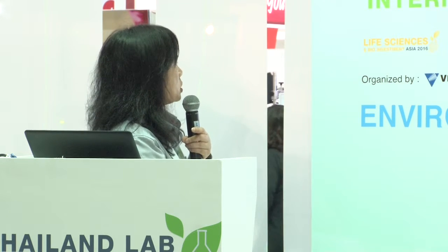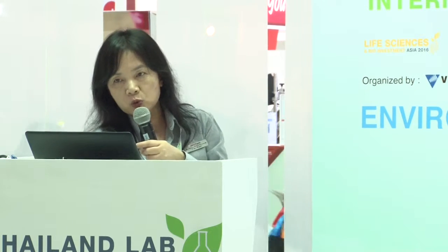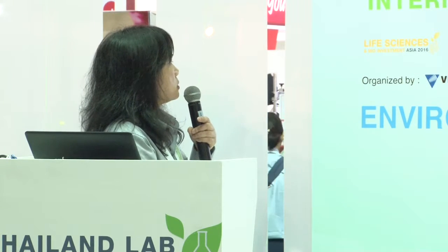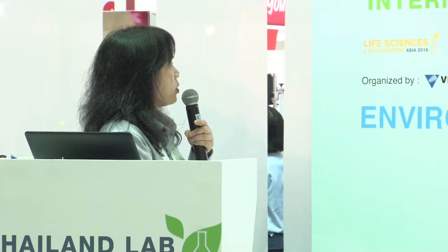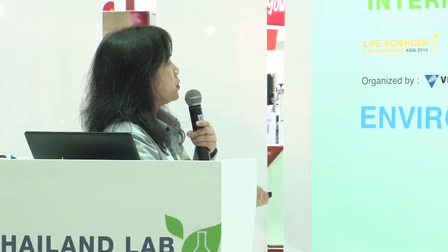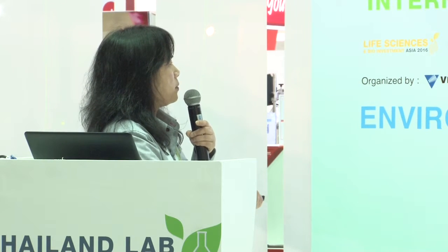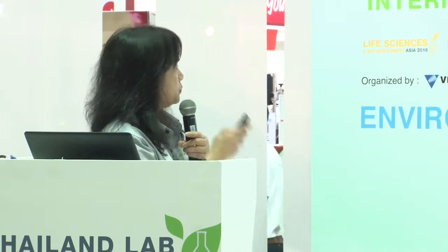Then we measure 1643 drinking water and 1640 surface water. So the certified value, the measured value, and then the difference and recovery. I don't need to read them out one by one; you can see the very good agreement between the measured and the certified values. Okay, all right, so I will go over there and show you the instrument.